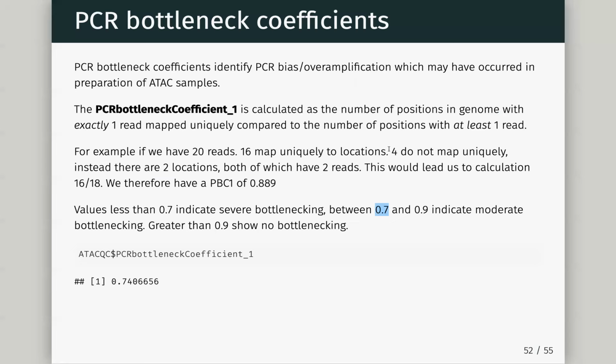Also, in this one we're going to use some of Christina Leslie's data, which is interesting because it is so much cleaner than the ENCODE data, but it is years on. What you can also see is that she didn't have any fragment lengths longer than a certain range, so she must have cleaned up her data at some point. To get rid of these ones we saw in the Greenleaf paper where they had 1, 2, 3, 4, 5, 6, 7, 8, 9, you don't get that in modern day ATAC-seq. It's only the first 3. I guess they do some size selection and clean it up quite well. You can see that for real in her data.